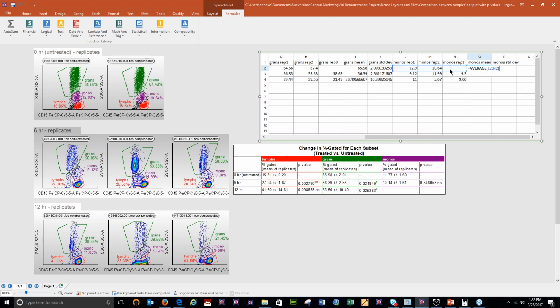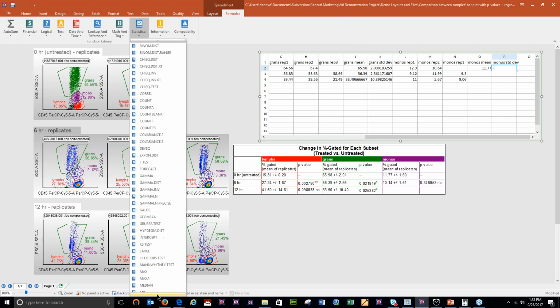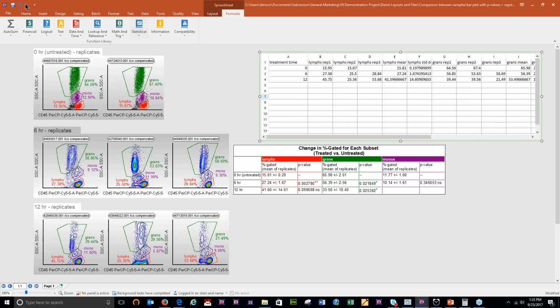See, that time I typed it free text. And then this is okay. Okay, so now I'm going to do my column fill again, my favorite thing to do in spreadsheets.